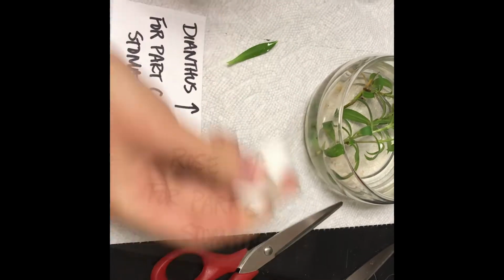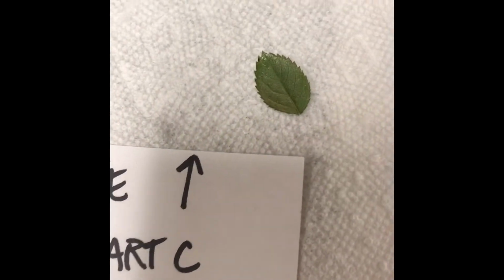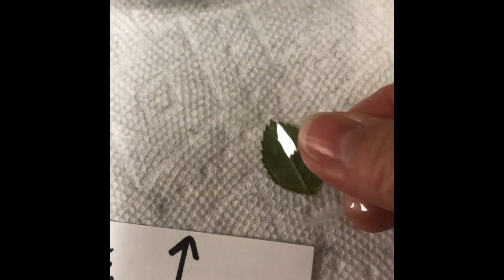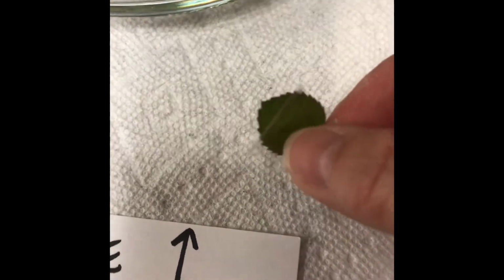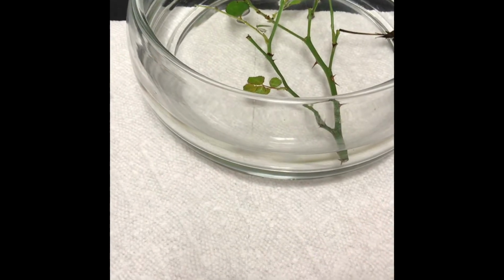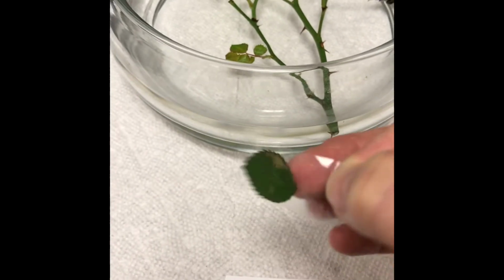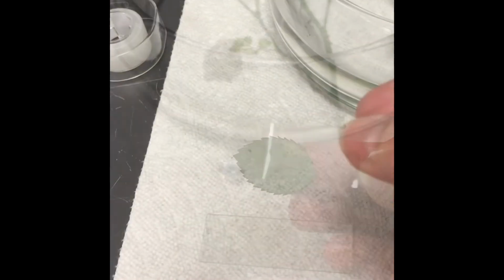Amazing. Good job. Okay, so now what we're going to do, our nail polish is dry. We're going to take a piece of clear Scotch tape right here. We're going to stick it where our nail polish is on the leaf, like this, and make an impression. And now that we have the leaf stuck on, we're gonna peel the leaf off so that we have an impression of it.